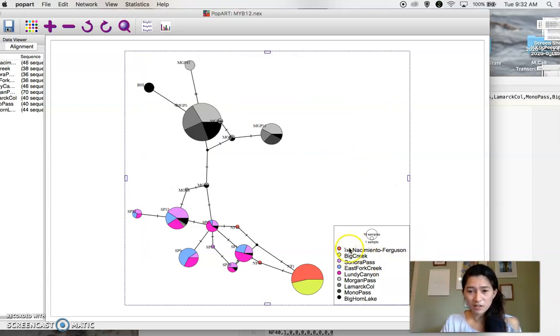Again, I'm going to try to get rid of these weird symbols at the beginning, but if it's there for you, don't worry about it. It's fine. So now we have our legend that's readable. It gives us even an indication. Remember, those bigger circles correspond to more samples, so it gives us an estimate of what a 1 sample circle size is compared to a 10 sample circle size. We have a readable legend.